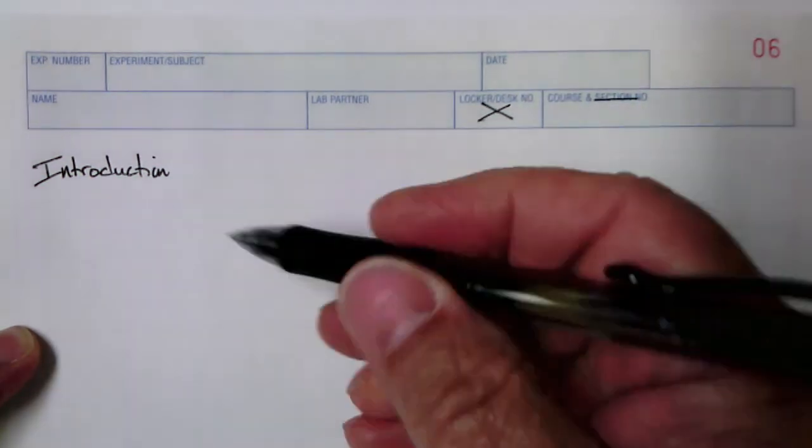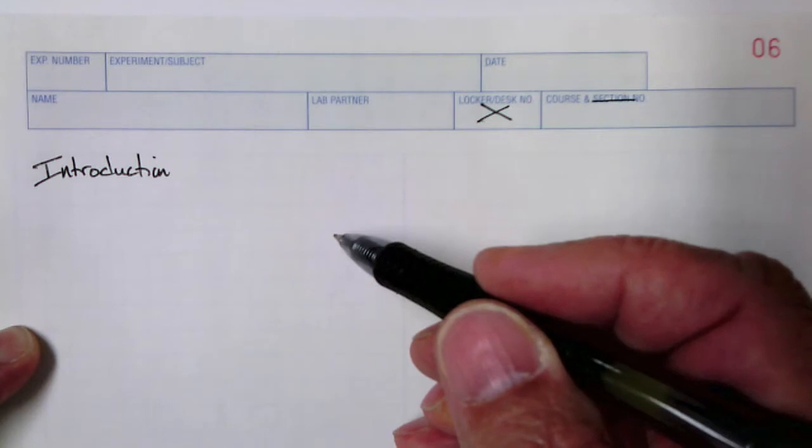Each laboratory handout that I give you will have an introductory section. Take that section, narrow it down to 1 or 2 sentences that describe specifically what you're doing in lab, and that's what you need to put in your lab notebook. And so you would put in a section titled Introduction, and under that you would write your 1 or 2 sentences. Now the page is divided by a vertical rule, and so you can either work down one column and then come back to the top and work down the other column. If you prefer to work across, that's fine. I think that working one column at a time actually works a little bit better, particularly for the introduction.